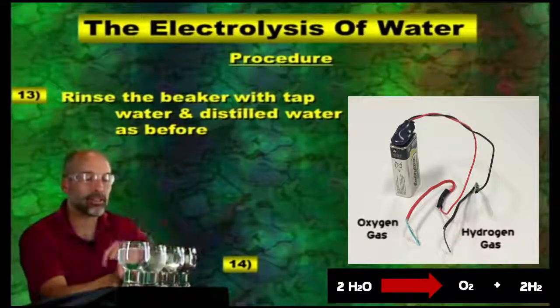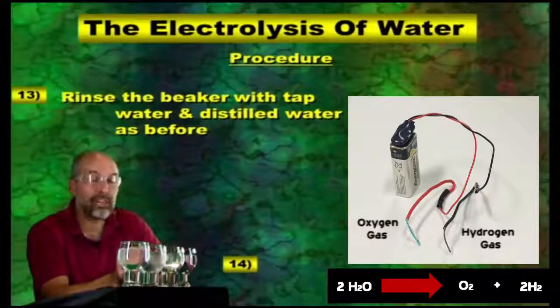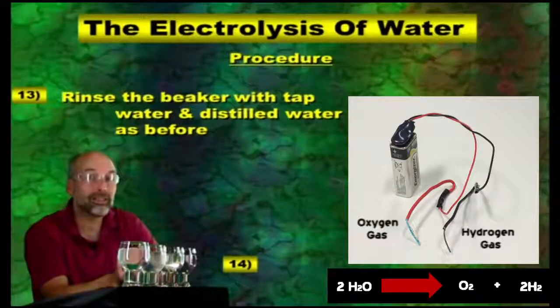And we can also start seeing color changes. Things are really starting to go really well now. It's really kind of fun. So all of a sudden, we're really seeing this works. Here we see indication indirectly that we are breaking down water. We're seeing the evidence of bubbles. We're seeing the change to this copper element. And voila, we see chemistry in action. How much fun is that?